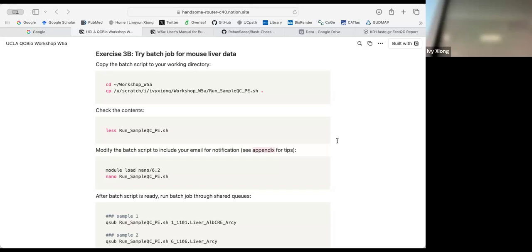Okay, yeah, you can open up the script. You can view it. That's for editing, so you go back to the other one. And then it was manual, it's wrong.